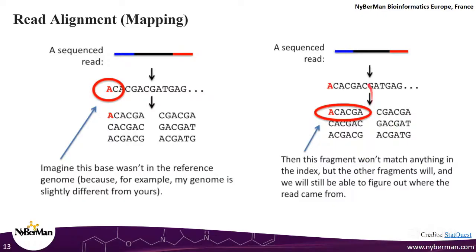Now what will happen is, out of this read, you made these 6 fragments, right? Out of the 6 fragments, only one did not match a region in the reference genome, but the rest 5 of them matched a region in the reference genome, and a contiguous region, mind you. Of course, it has to be a contiguous region because this is a continuous read, right?